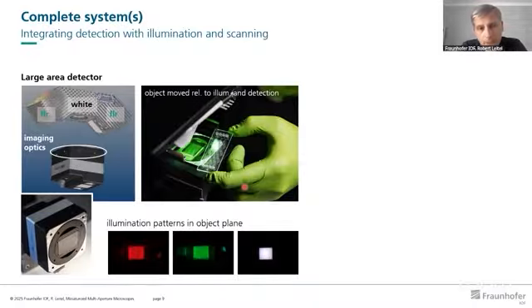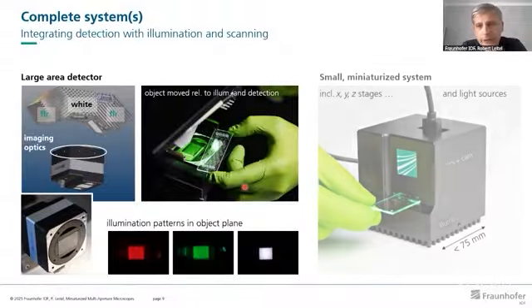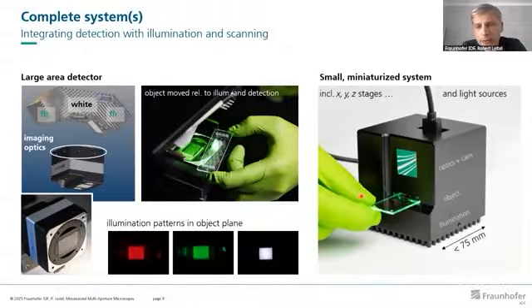channels and gain the images from software stitching. Or for the small system here, it's shown it's very, very compact. It has only 3 cubic centimeters of total image optic size, and it's quite easy to have this as a compact and portable device, for instance, for point of care diagnostics.